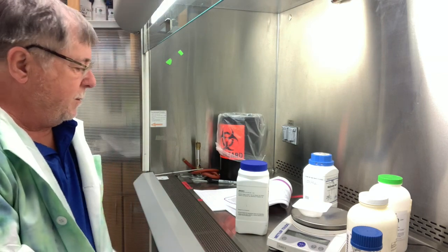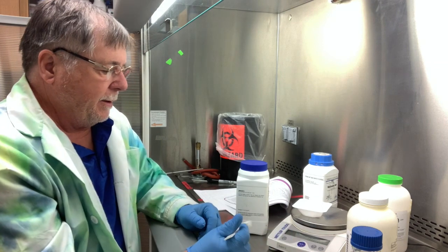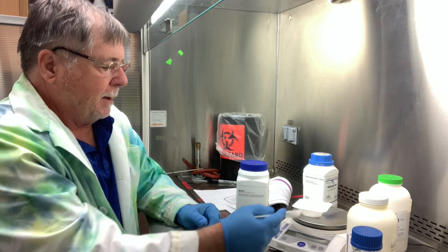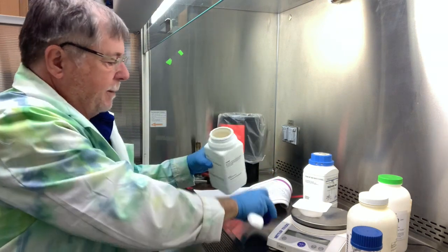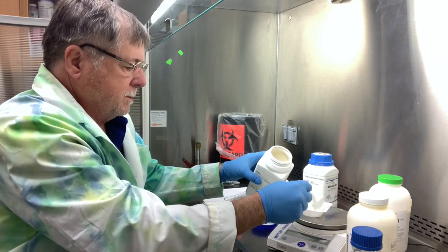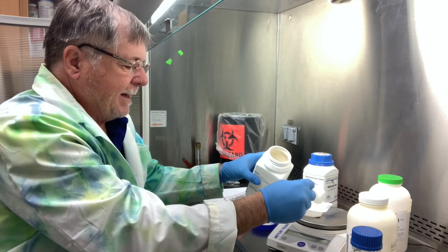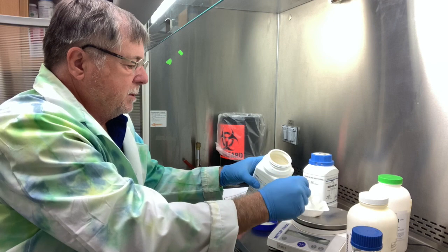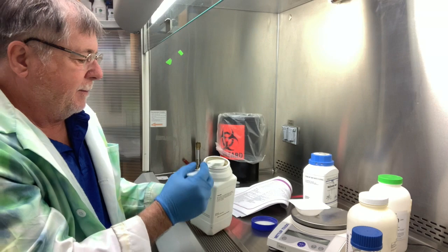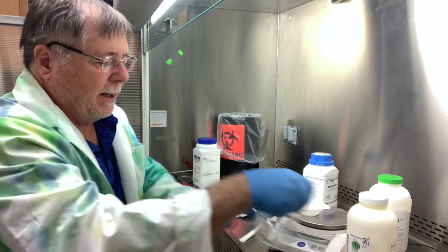So what we're going to do is weigh this out, and first thing you want to do is make sure you tare or zero out your balance with the weigh boat, and then we're going to add 3 grams. It doesn't have to be exact, but you want it pretty close, within a tenth of a gram. Okay, so there we have our 3 grams, and we're going to add that to our bottle.